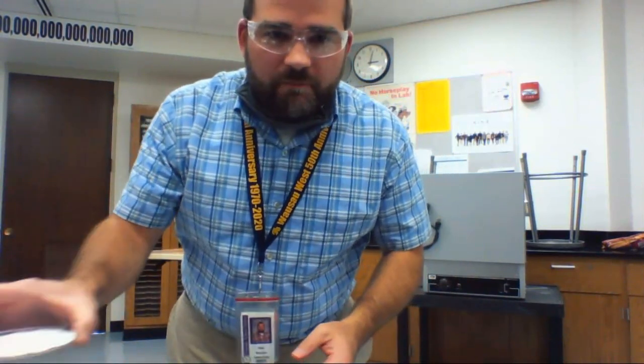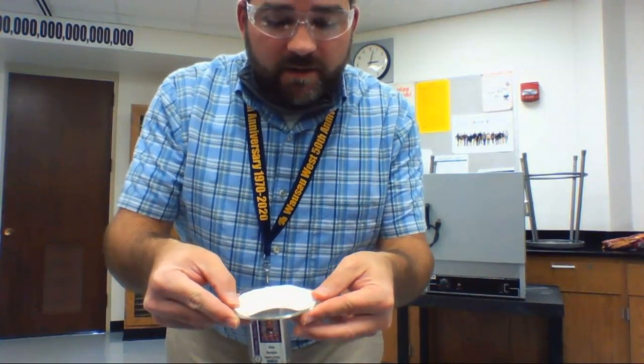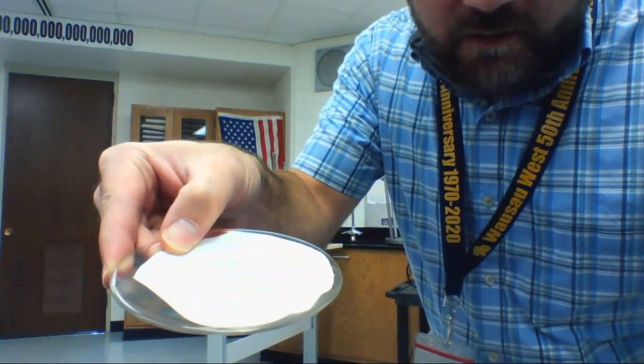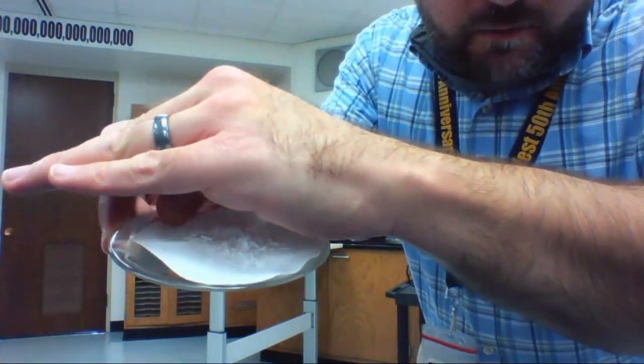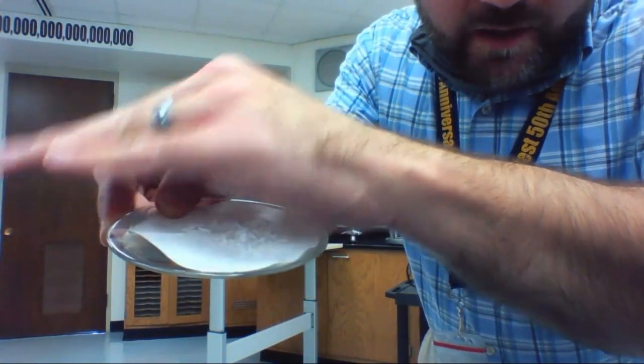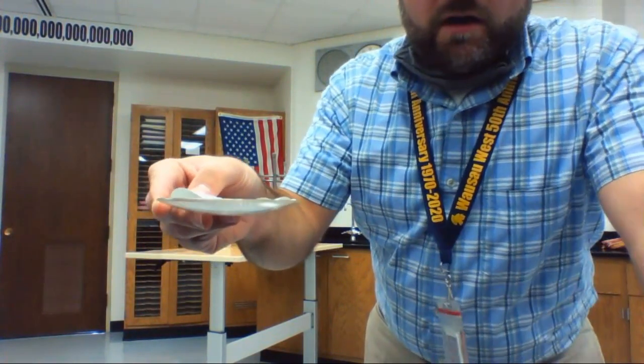All right, so I have dried my watch glass with my sample multiple times. Again, it's going to be tough to see because it just seems like the light kind of doesn't quite let you see what you need to see. Maybe if I shade it. Or now you can kind of see the powder a little bit, maybe. But yeah, I have all my powder on there. I've done multiple drying cycles. And now I'm going to take this and mass it, all right?